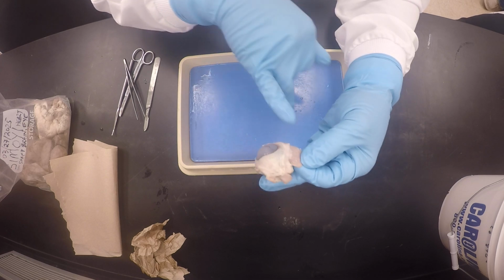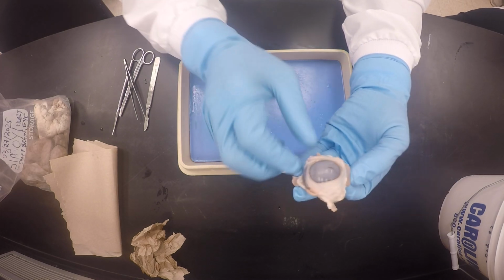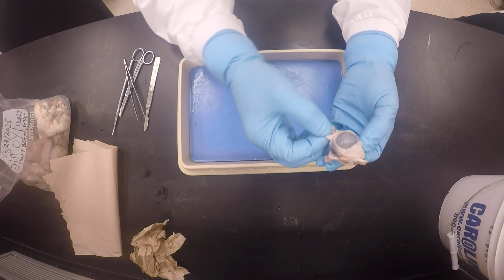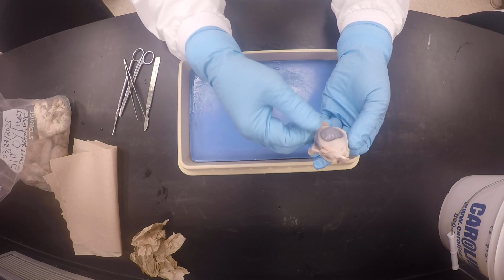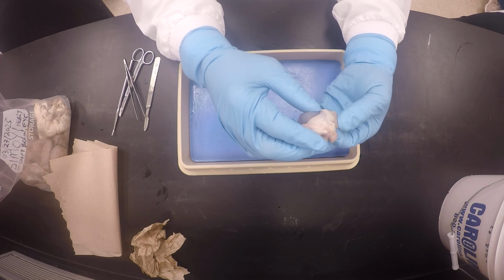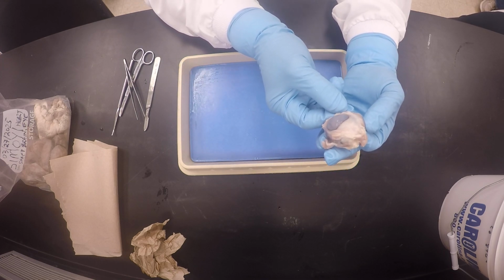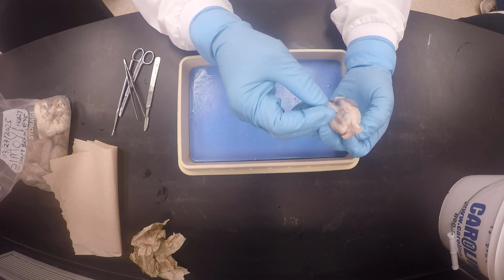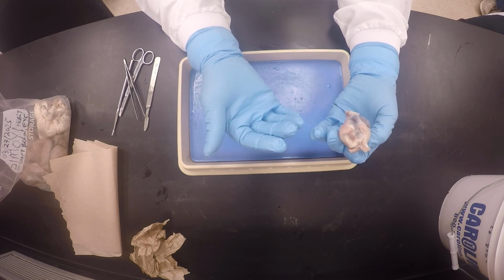You see, this is the rectus, and this is the inferior oblique. You see, it's pointing to this side, which unfortunately they also kind of ripped most of, but you do have little remnants of the inferior rectus here. Do you see what I'm saying, my good friends? Okay, so this would be the lateral rectus, and then this itty bitty part that's going down here would be the inferior oblique. You see, because this short side, definitely there's just one muscle there, so it's got to be the medial side. You see what I'm saying?